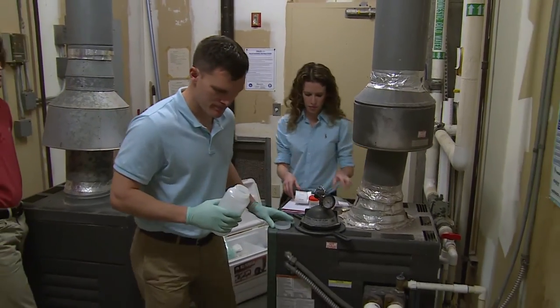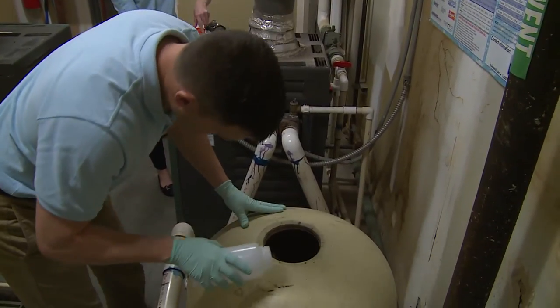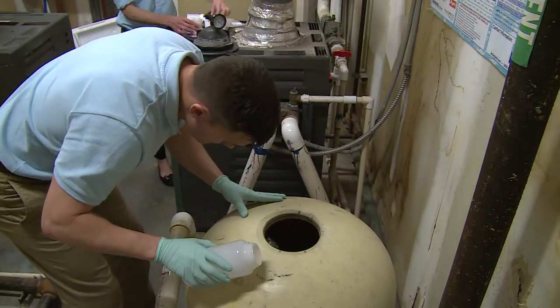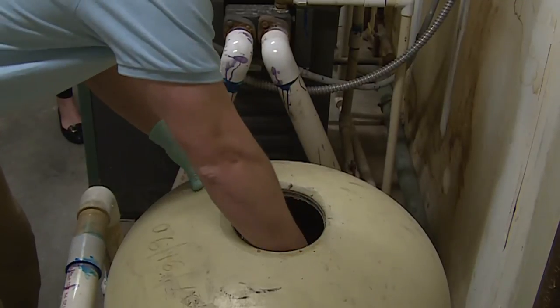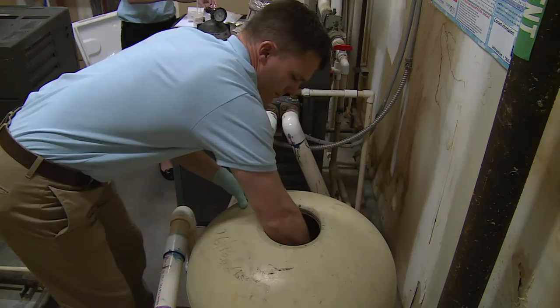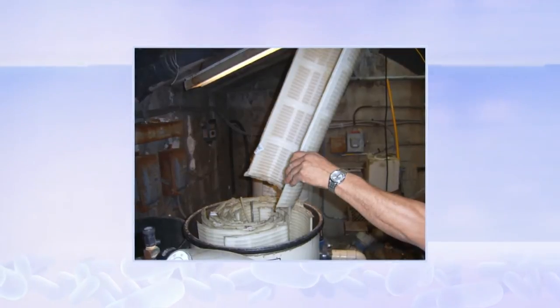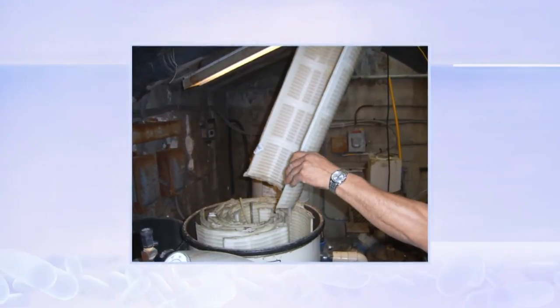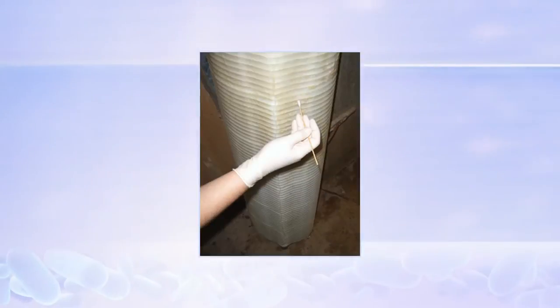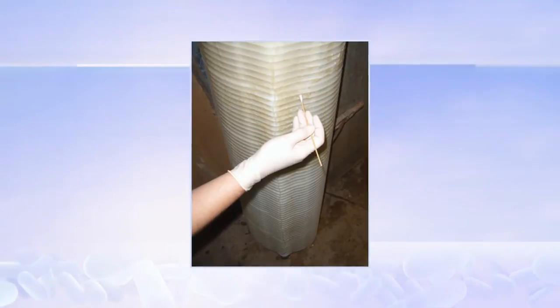When sampling sand filters, collect some sand in a 1-liter bottle and enough water from the filter chamber to cover the sand. If the spa has a cartridge filter, cut a portion of the filter to fit inside a 1-liter bottle and add enough water from the filter chamber to cover it. If the spa uses a diatomaceous earth filter, collect some water from the filter chamber into a sterile 1-liter bottle and use a sterile swab to scrape diatom powder from the grid. Make sure it is completely covered by at least 1 inch of water.